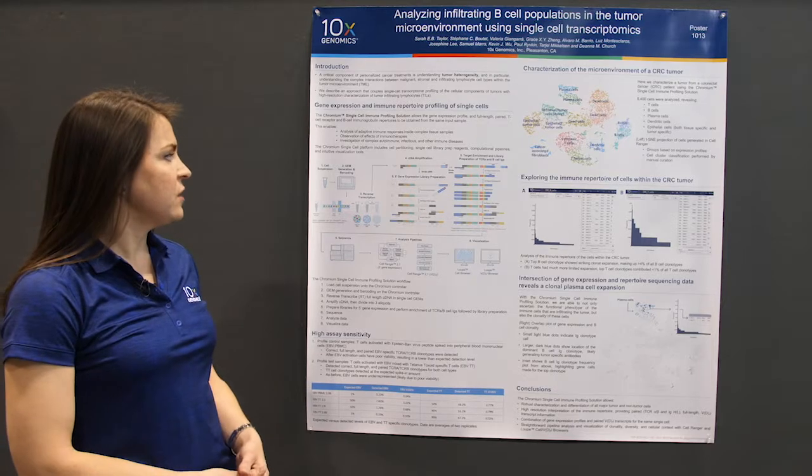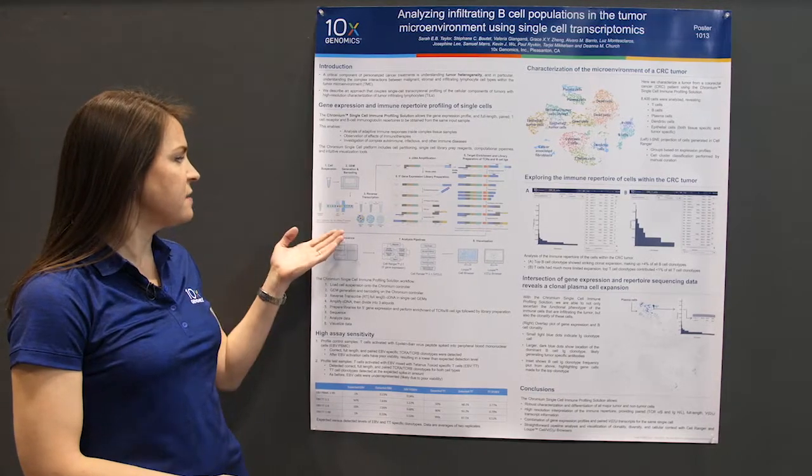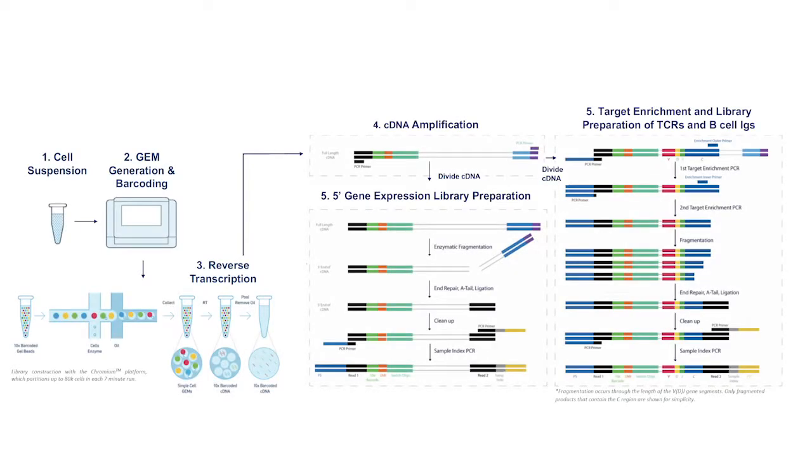We use the 10x technology, which partitions cells into droplets with gel beads, and then perform reverse transcription, individually barcoding the single cells so they are uniquely addressable. We then perform cDNA amplification of all the cDNA we generate in the RT reaction, and from that amplified cDNA generate multiple sequencing libraries. We use one aliquot to make a gene expression sequencing library with a standard workflow.